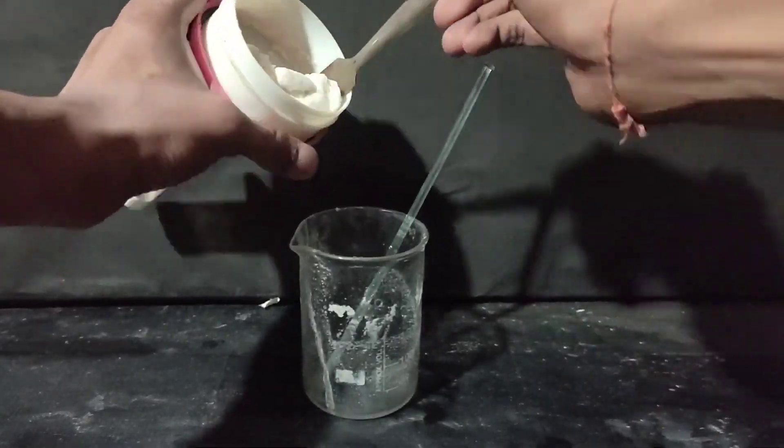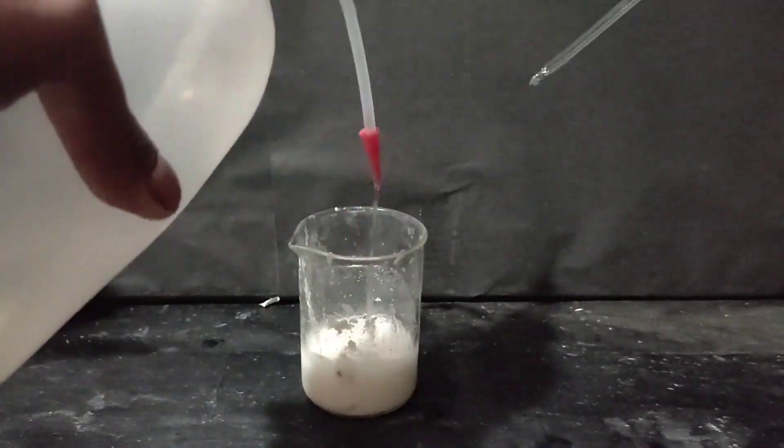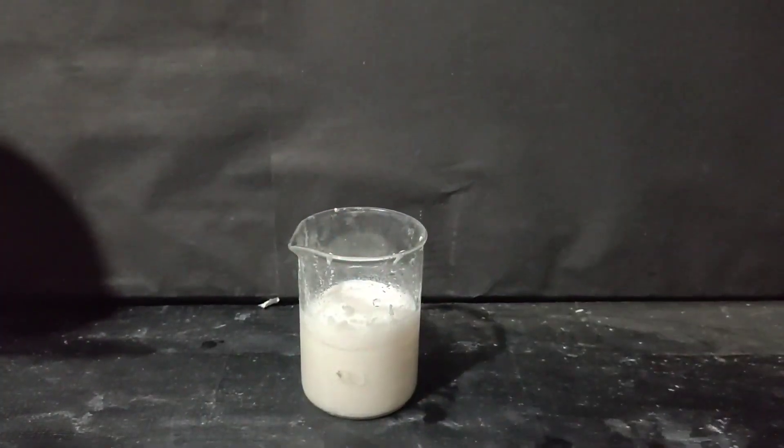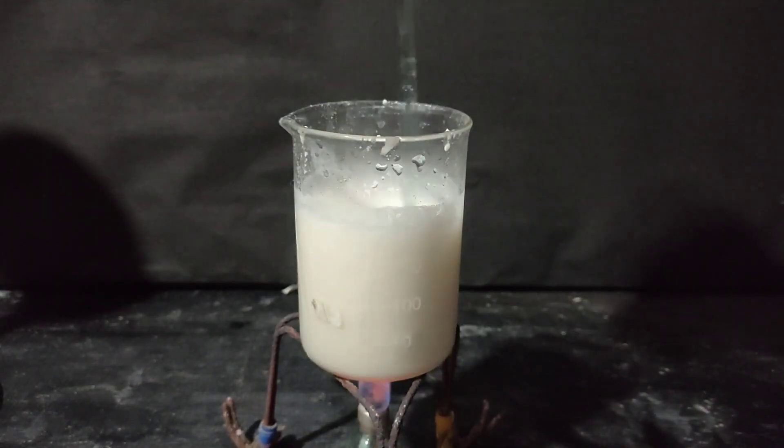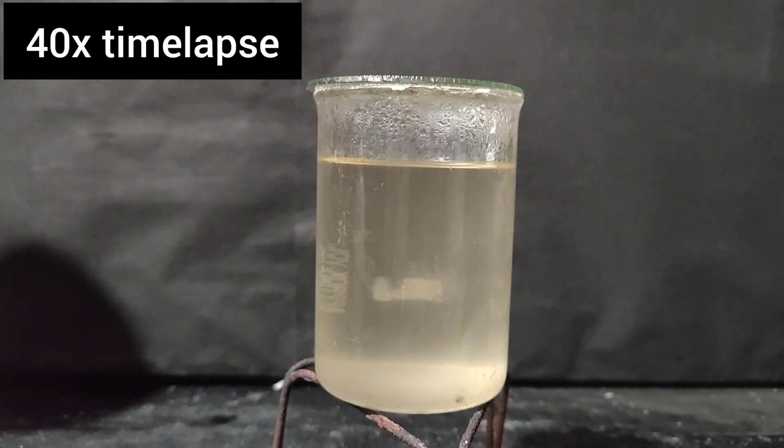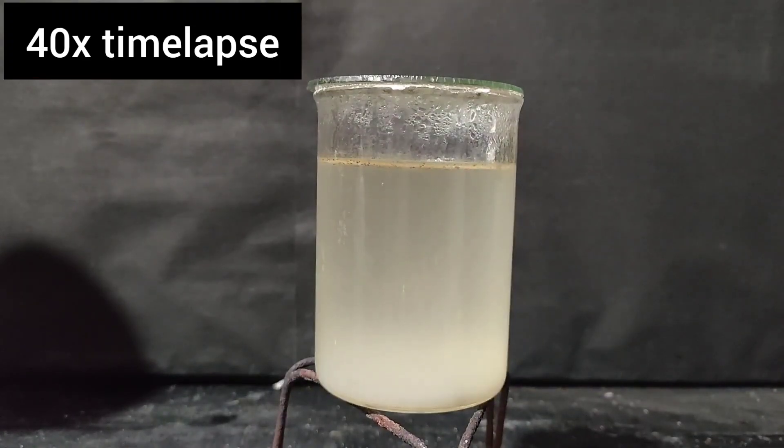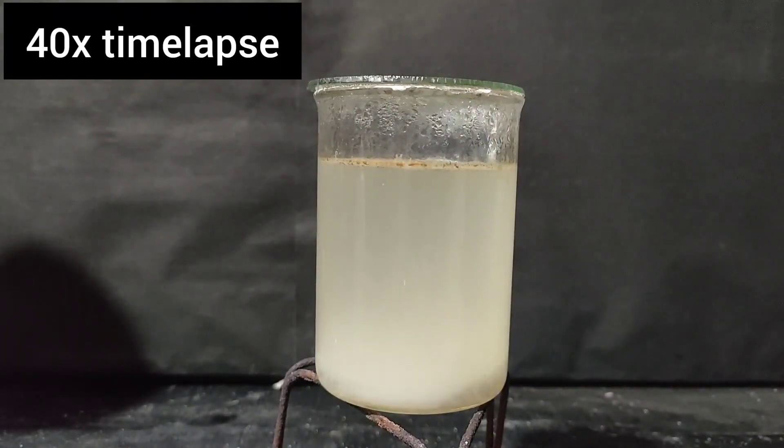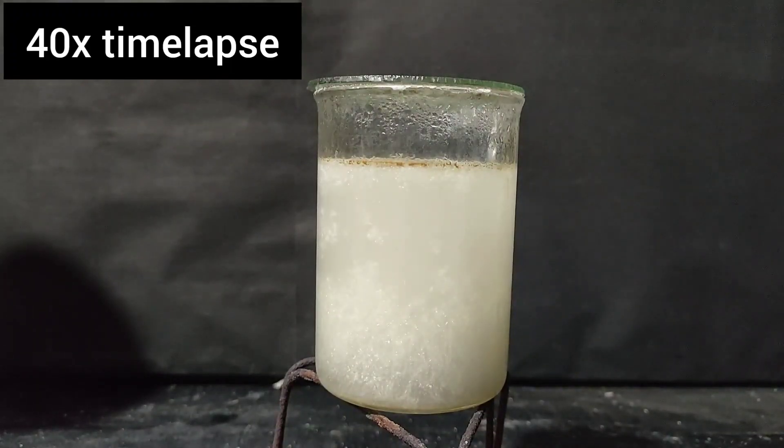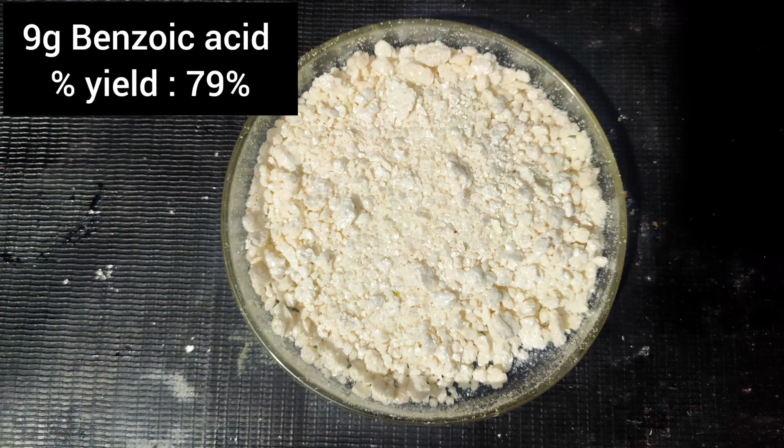Then the precipitate was transferred in a beaker and it was recrystallized from distilled water. Benzoic acid is soluble in hot water so I kept on adding water in small proportions to the boiling solution until everything dissolved and then let it cool at room temperature. As the solution cooled, benzoic acid crystallizes out. The crystals were filtered off using vacuum filtration and dried in a desiccator. The yield came to be 9 grams that corresponds to a percentage yield of 79%.